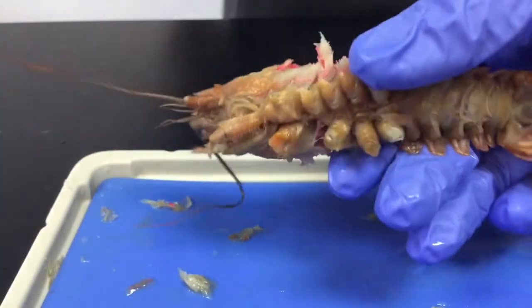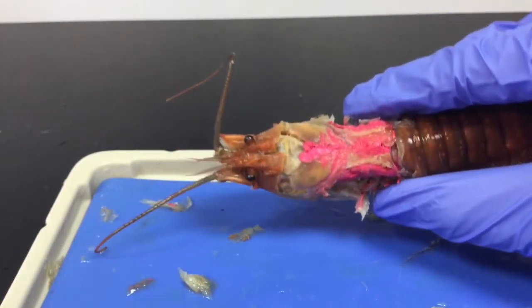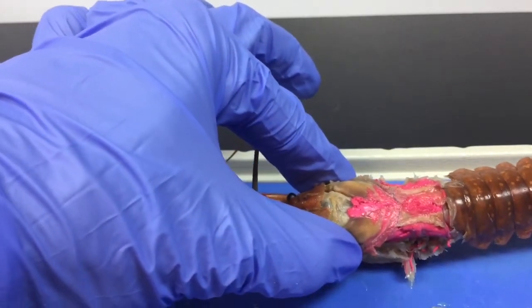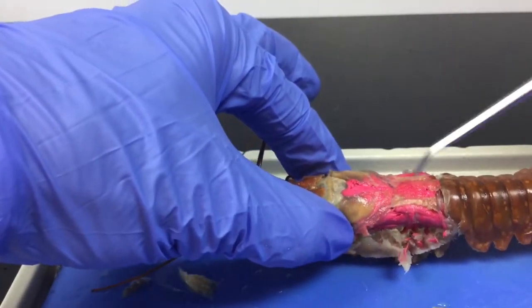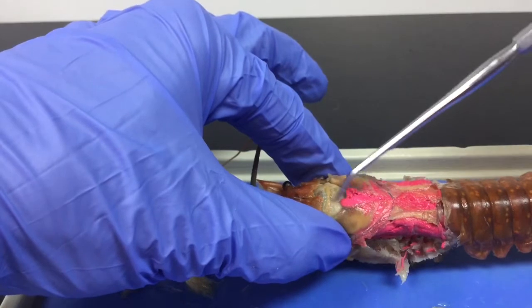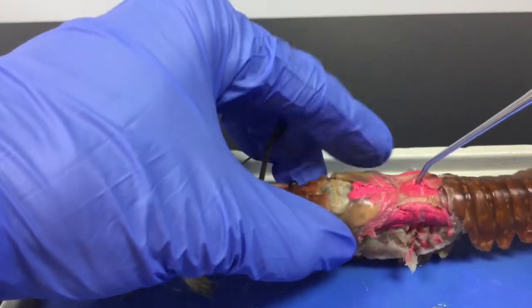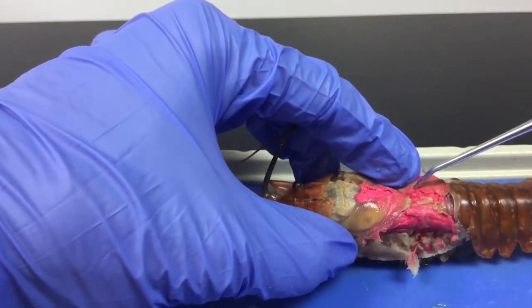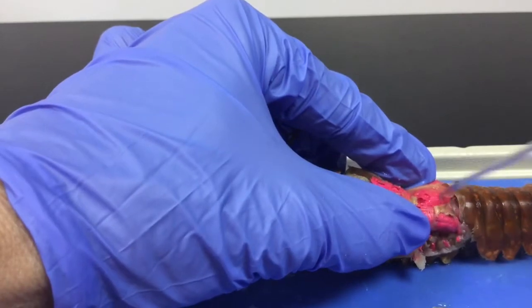Okay, here we've removed the legs that are attached to the thorax. So the walking legs and the chelipeds are part of the walking legs. And the pink you can see is the blood vessel system. Remember, they have an open circulatory system. This means that the blood leaves the vessels and actually bathes the organs. So you can see how there's a lot of pink going on. But right here is the dorsal heart. It's called the mid-dorsal heart: mid in the middle, dorsal on the back, and heart because it's like a chamber where the blood is pumped through. So we can see that right here, the mid-dorsal heart, kind of reflecting some of the tissue here to find it. See that mid-dorsal heart.